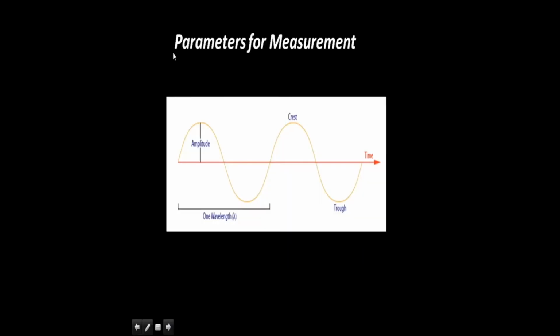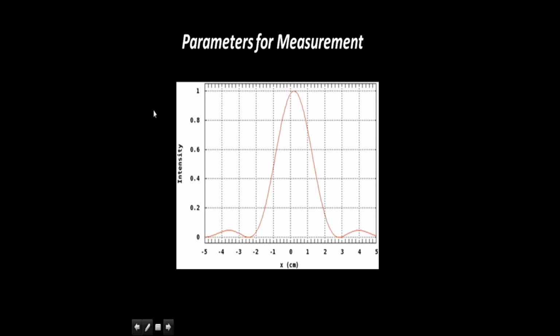Two most important parameters are measured during the emission process. The first one is the wavelength of emitted radiation. This wavelength of emitted radiation gives the identity of the element which has emitted the radiation. The second most important parameter is the intensity of radiation, which is proportional to the number of atoms present in the element, that is, to the concentration of the element. Intensities received from the optical system are converted into electronic data and interpreted by means of a readout system.